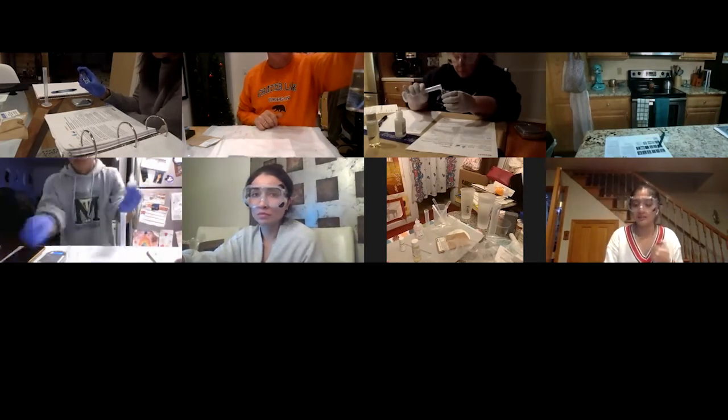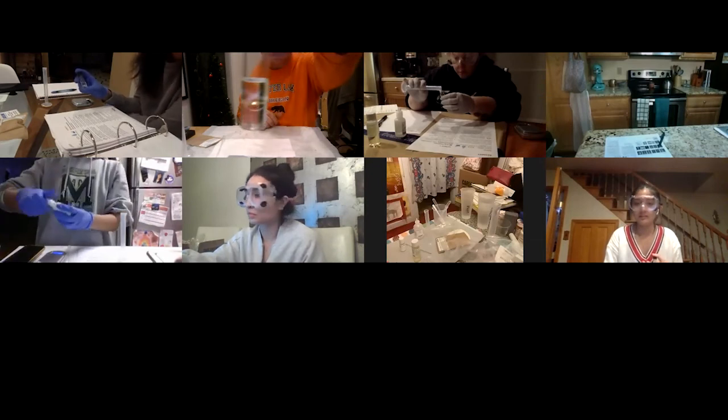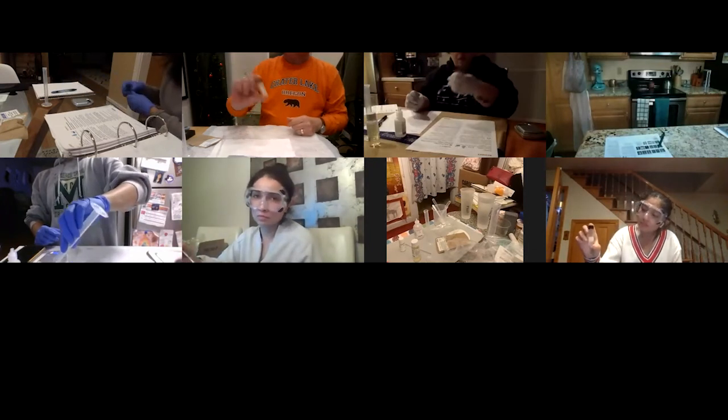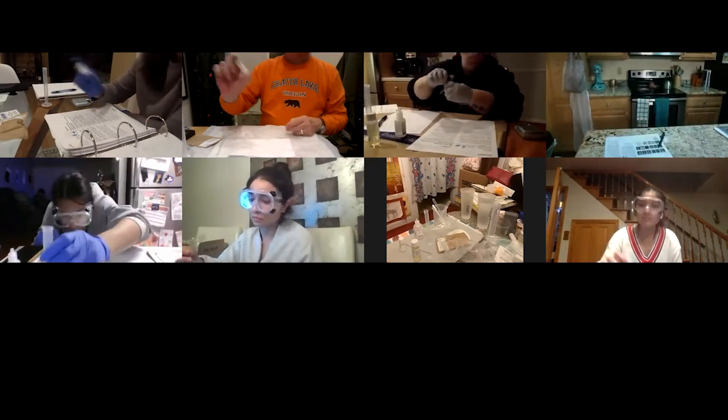No. We're going to let it sit for 5 to 10 minutes. So you can see it's already separated: oil on the top and the sodium hydroxide on the bottom. You shake it for about 30 seconds or so, and then basically we will let it sit.